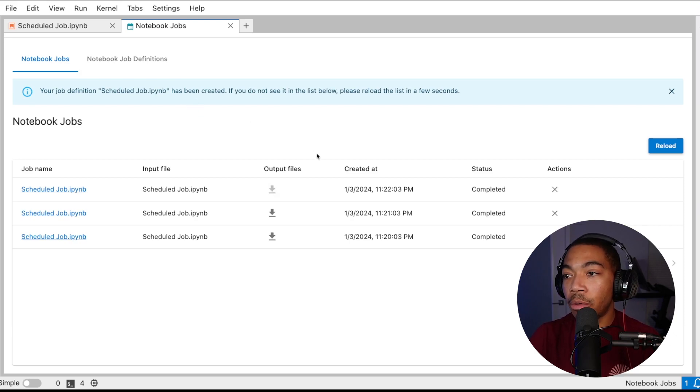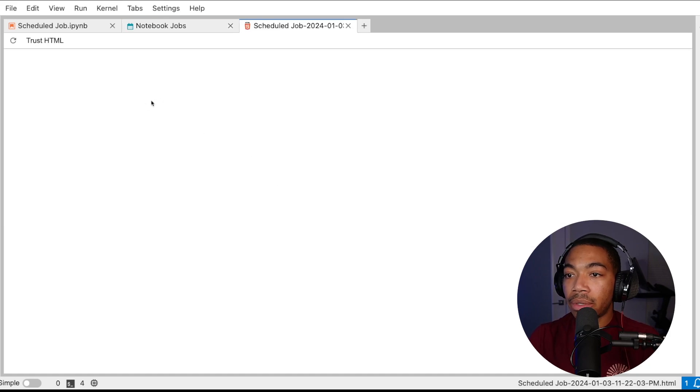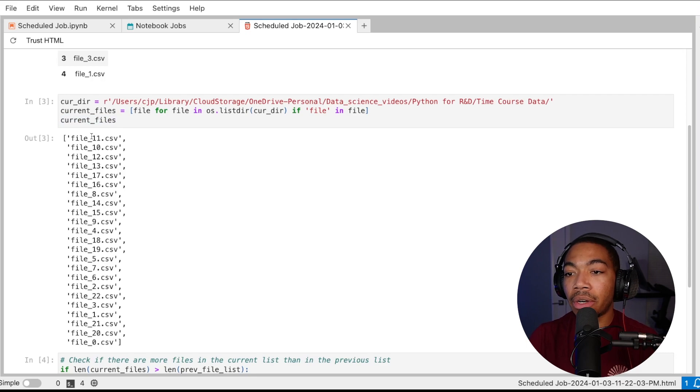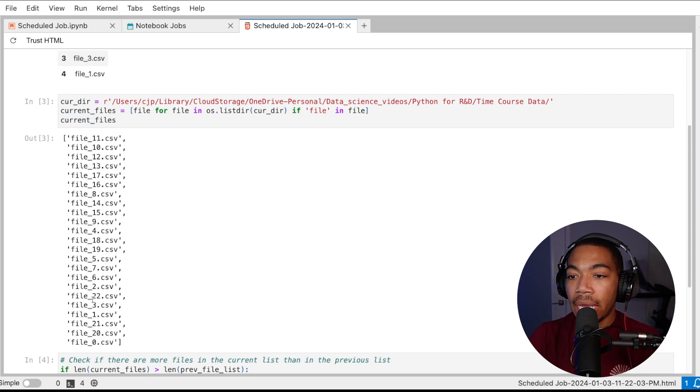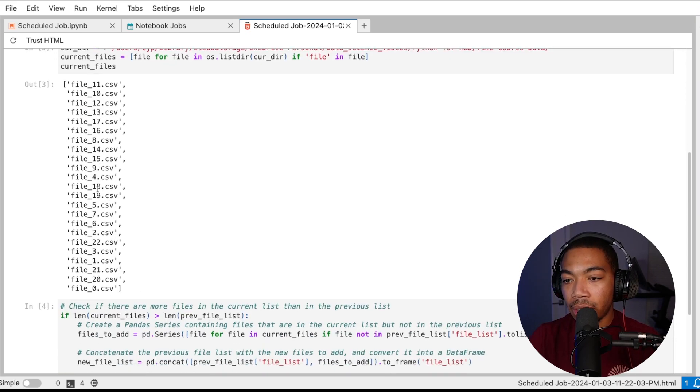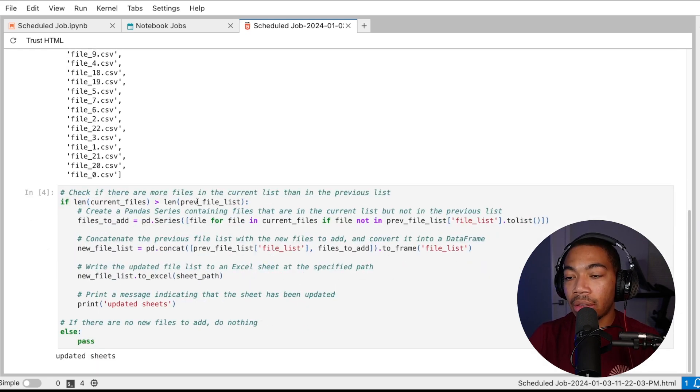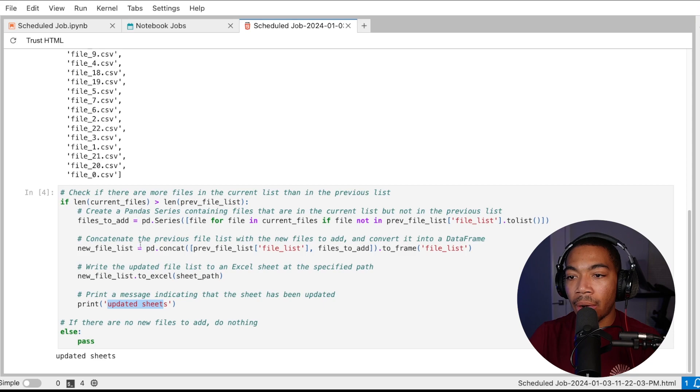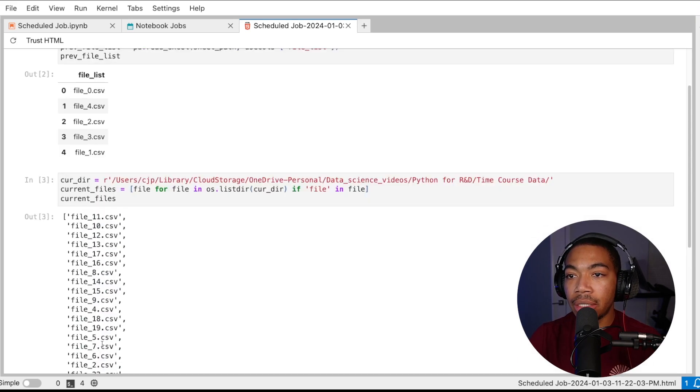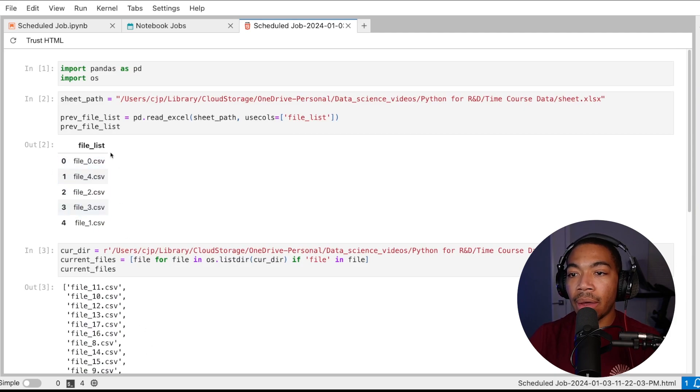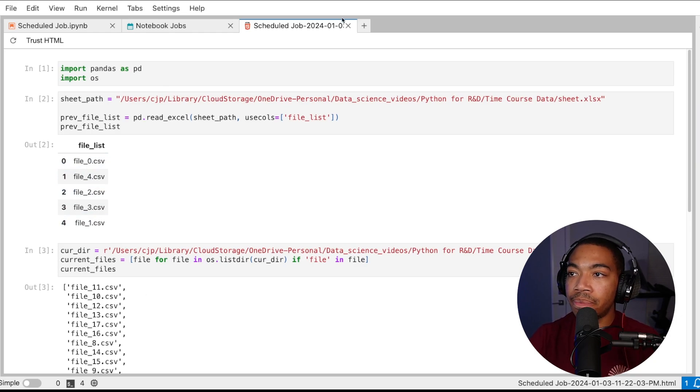And we can look at the output files. In this case it's just going to be the HTML based on how we set up the notebook definition. Based on this we have a few outputs so we can see that the current files, which is going to be based on our last data transfer, is several files long. Based on our flow, the current length of current files is greater than the length of the previous files, and so this updated sheet means it took this path through our if statement and has now outputted the updated sheets. We can see that before this transfer, previous file list only contained files zero through four, and so of course this works out.